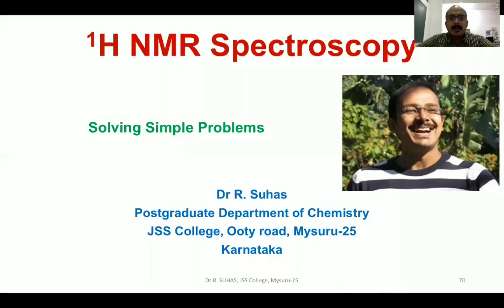Hello everyone. In this lecture, we are going to solve some simple problems related to 1H-NMR spectroscopy, which mainly deals with chemical shift value, the splitting pattern, and predicting the chemical shift also. And also we will deal with some of the sketching of NMR spectra of simple compounds. We will see one by one.